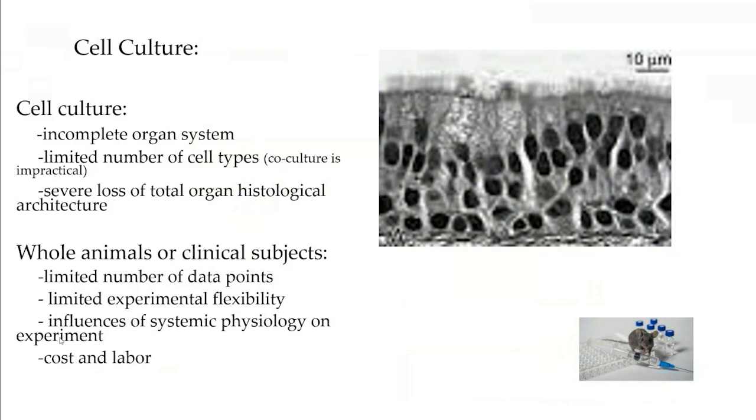So the slices make this much easier in that you can do good science with many experimental groups, and you don't have to manage all those animals. So that gives us a huge experimental advantage, which is why tissue slices are becoming more and more popular.